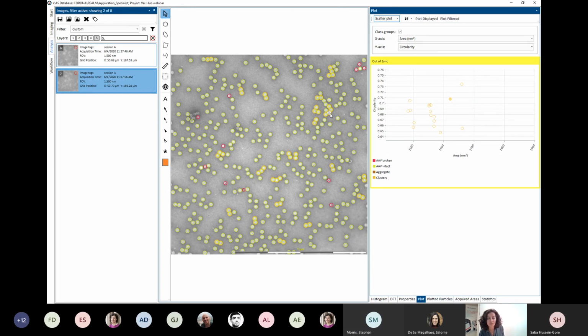We have imported these previously, so we can work with most TIFF files. So if people have got images already, then they can just send them over. Exactly, and that would be really quick. We have got a quick way of receiving the images, and we can convert them quickly and look at them immediately.